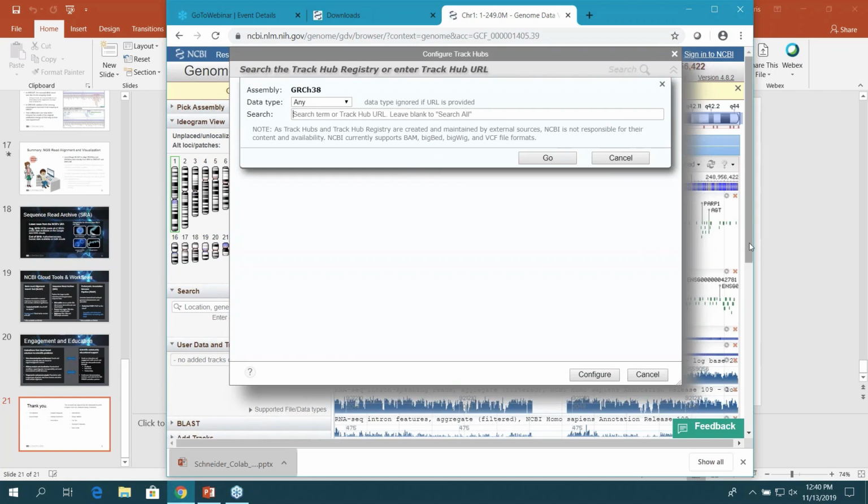We also have an NCBI provided track on regulatory regions associated with genes that was developed by RefSeq. You can load all of these tracks up into the browser and zoom out and pan along to find regions where you might find significant amounts of overlap in data between different tracks. But that's a really interesting suggestion, that we could have a way to help jump the browser to places where, for any given collection of tracks displayed, there was data in 2 or more tracks.